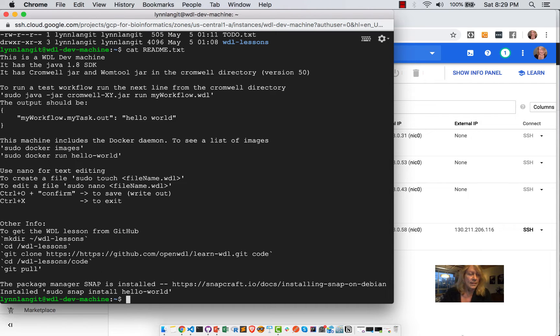And you can see that Cromwell, as I mentioned, is a Java JAR file, so it requires the Java SDK to run.